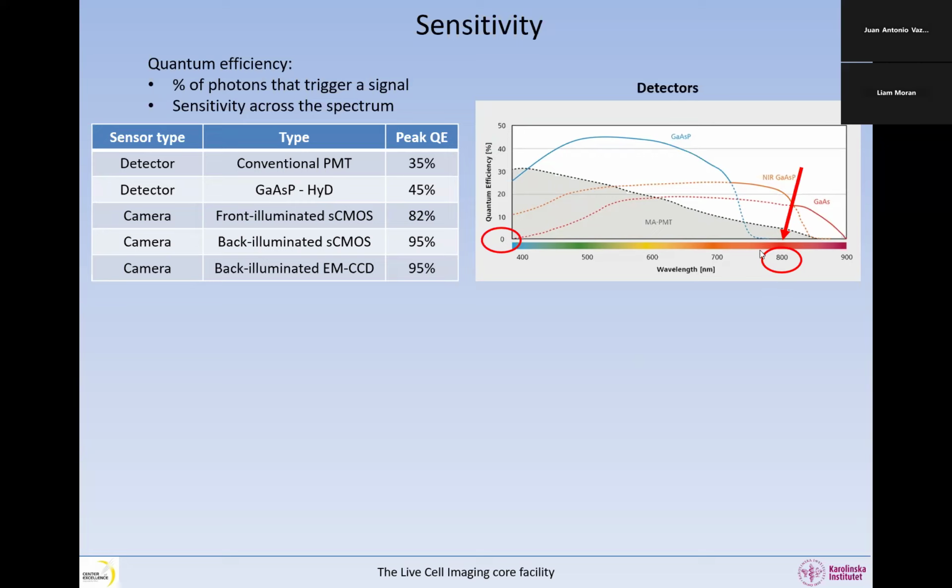But also the lamps, right? Like the halogen lamps. Well, yes, halogen lamps, but also the mercury lamps, they do have a lifetime. LEDs have a much longer lifetime than mercury lamps, for example. But that is quite common. So we have changed the halogen lamps many times on our systems. We do not look at the fluorescence in the eyepiece, so we do not use any mercury lamps. But LEDs are quite long. They take a lot of time.